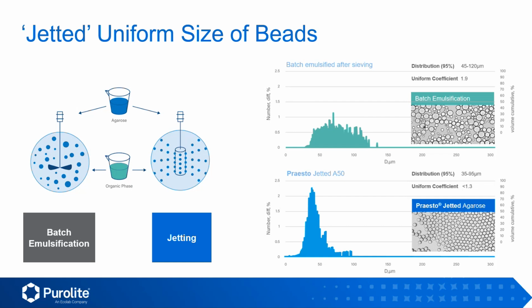And this essentially means that when you're packing a column, there's the potential for a much more efficiently packed column, which eliminates voids and provides a range of benefits, which I'll talk about in the next slide.